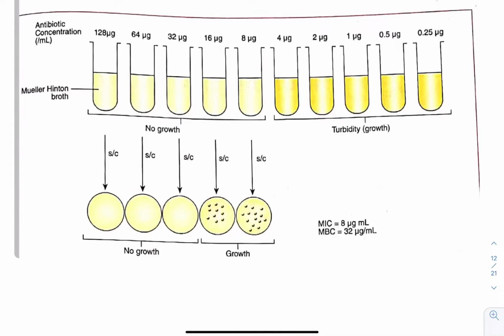Now you want to find out the MIC and MBC of this. So this is the antibiotic concentration per ml, in micrograms, and you want to calculate the MIC and MBC. Now, when you come next day, this is the picture you find. What you have observed is that at the concentration of 0.25, it remains turbid. That broth, which had turbidity the day before, still maintains it, and in fact it is the same or increased.